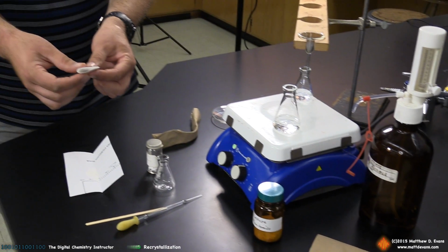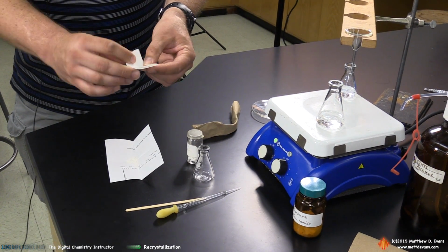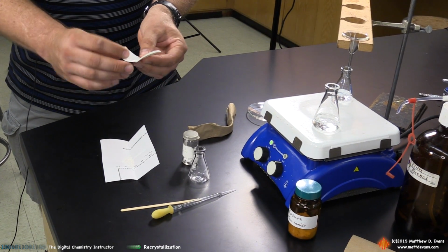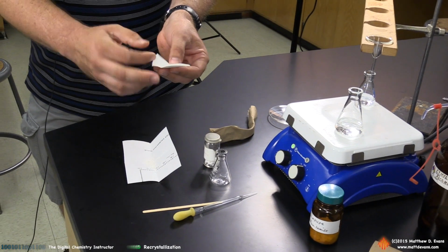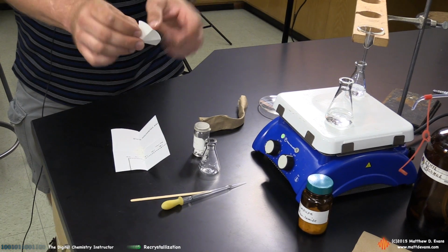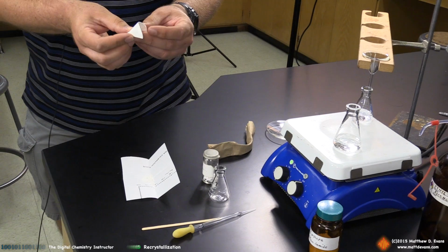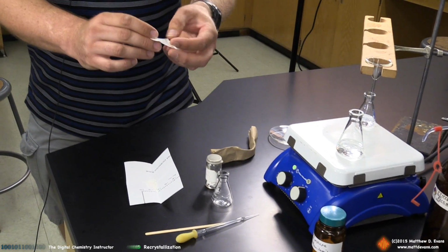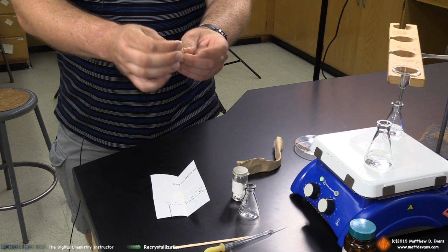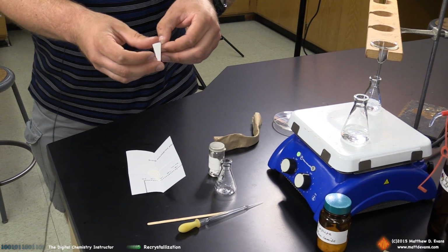This is a small piece of filter paper that we're going to make into what's known as fluted filter paper. You just simply fold it in half again. Open this back up just to that point, fold it towards the center, back out, fold it towards the center again, back out. And then you take the edge and you fold backwards onto the first crease, then the second crease, then the third to the center crease. Do that on the other opposite side, back to the inner crease, forward, backwards. And then you just compress it all into an accordion shape, open it back up. And you've got what's known as fluted filter paper.